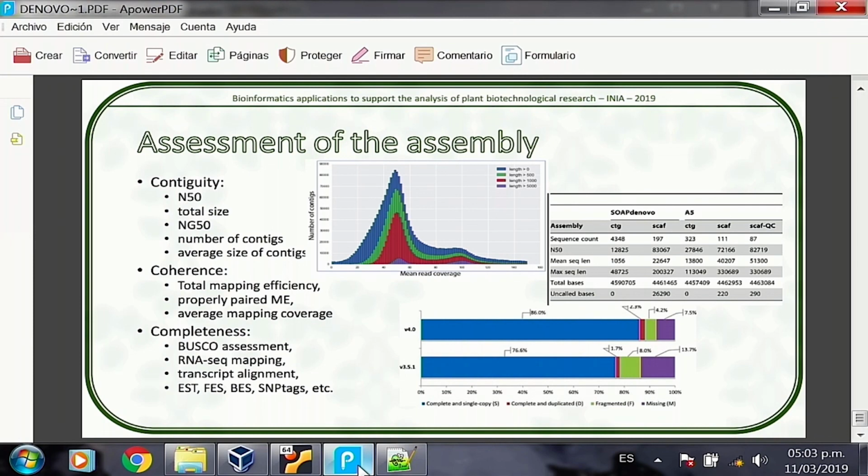but more often than not, most contexts should have that coverage. So if I map the reads back to my reference genome, I would expect that for every position in my reference genome, I should have more or less that coverage, or more or less that depth. So if I was expecting 30x coverage, or 30x total depth, that means that for every position in my genome, I should have around 30 reads aligned to the same position.